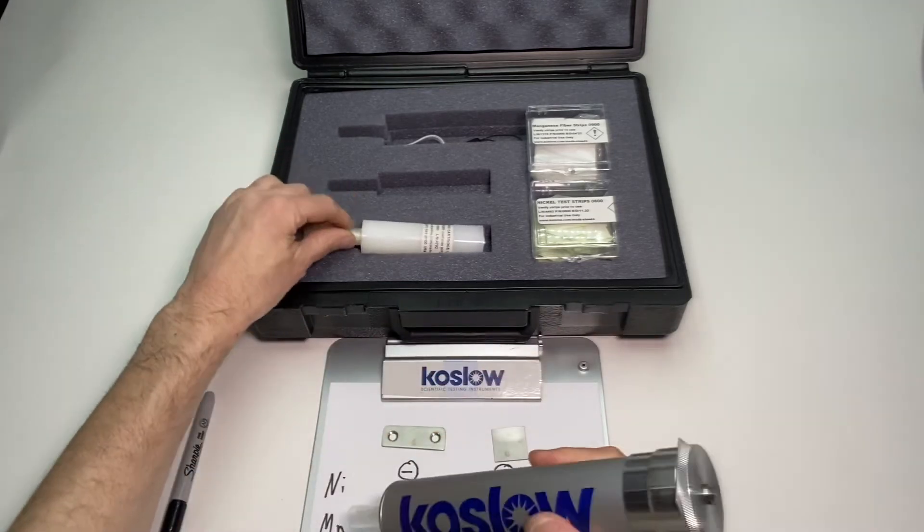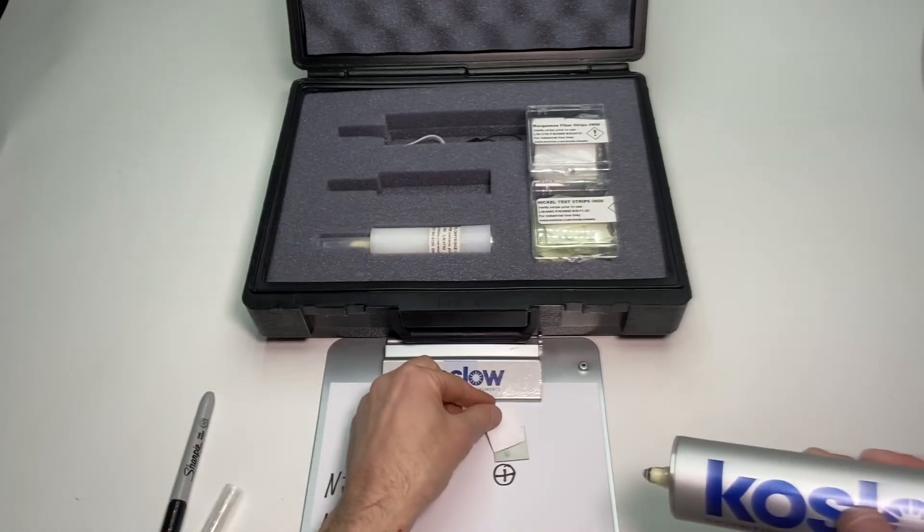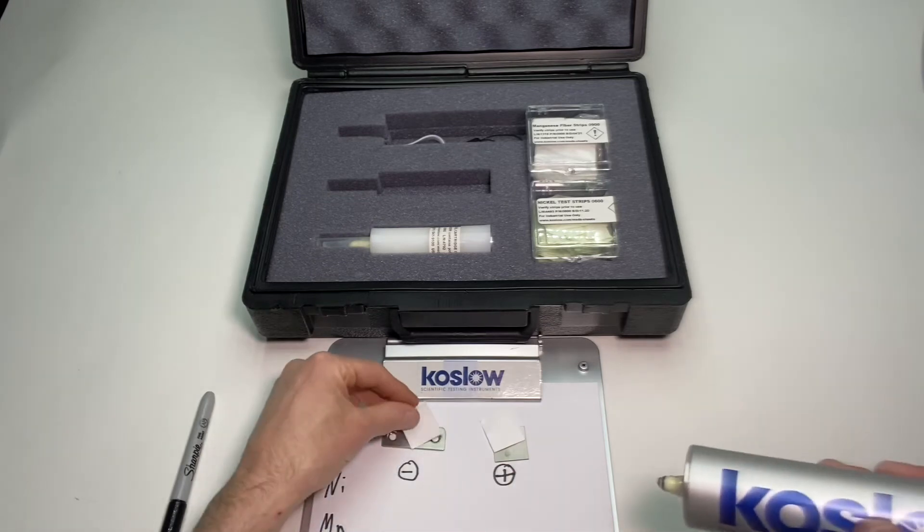Now we're doing the manganese test. I get out the manganese paper, also included in this kit.